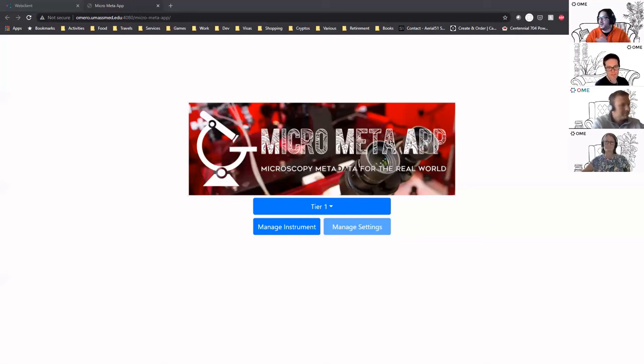Obviously, it requires having another dictionary, because everyone uses the field naming convention they want, and that's one of the big problems. That's why there is this effort from the 4DN initiative to create something that is a little bit more unified, at least an attempt at unification.